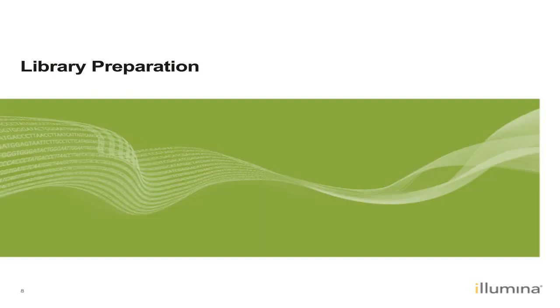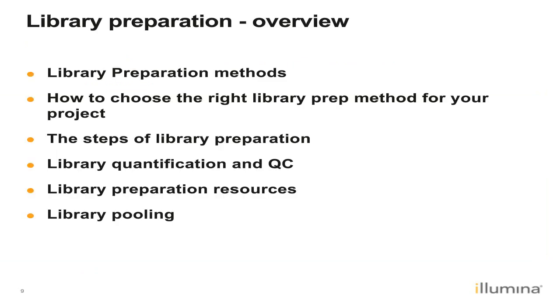Now let's proceed to library preparation. We will discuss library preparation methods, how to choose the right library prep method for your project, the steps of library preparation, library quantification and QC, library preparation resources, and library pooling.